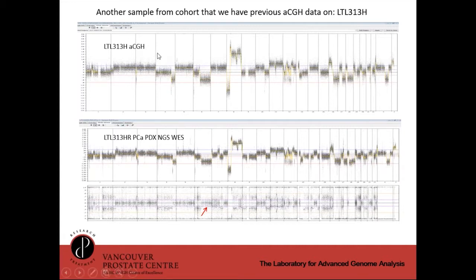But one thing that we noticed is back in 2014, when we finished this, we thought, hey, this is great. We're done here. This is good to go. We've got 5 copy number states. We've got the homozygous loss, single copy loss, diploid, gain, and amplification up at the top. It's probably centered around diploid. Bang, done. We're finished here. But when we run it now, as I just did about a month ago, I ran a similar sample. This is a recurrent sample of this patient, and we ran it again.